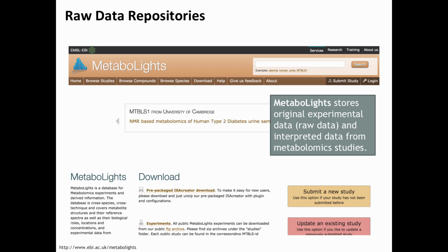And all you need to provide, if somebody sends an email asking where is the data, is to just say, MetaboLights, ID MTBLS435, and go there, have a look at it, have fun with it. The other thing is, if you do that, you will get more citations. People will use your data. Bioinformaticians, I have been called a data parasite, but you know, that's the whole idea of science. You build upon what other people have done. It's not parasitism, it's actually making good use of the money that other people spend.